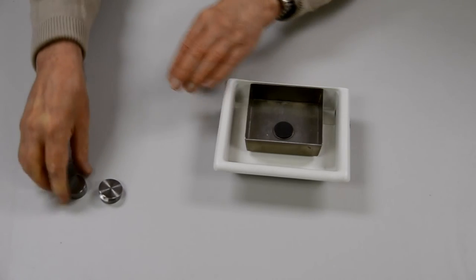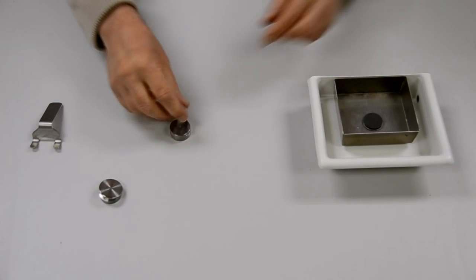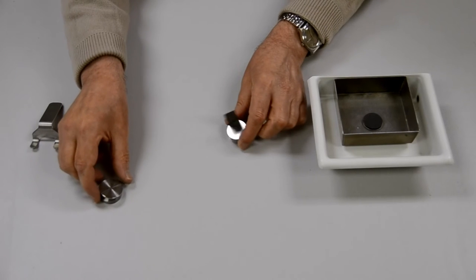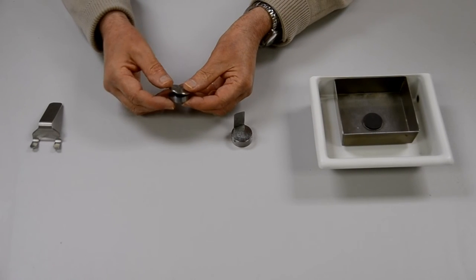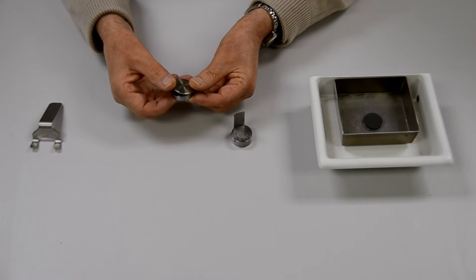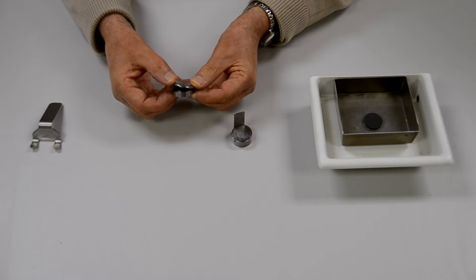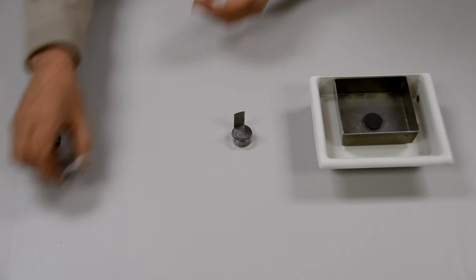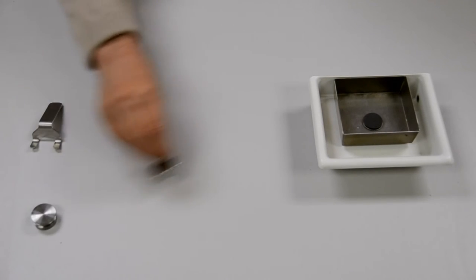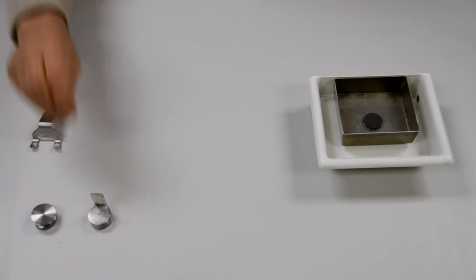We supply two types of specimen mount with each slicer: a fixed mount and an adjustable angle mount. The adjustable mount has a platen that can be locked in any altitude up to 15 degrees away from the horizontal. We can also supply specimen mounts made to your requirements having any specific presentation angle that you may want.